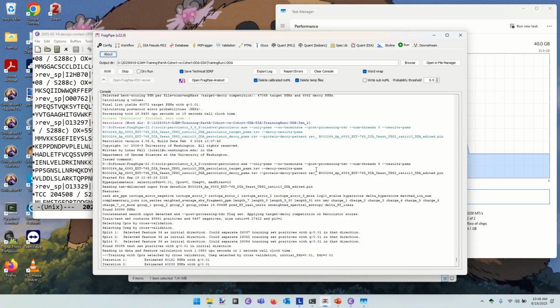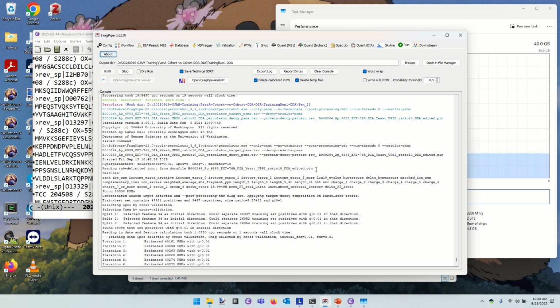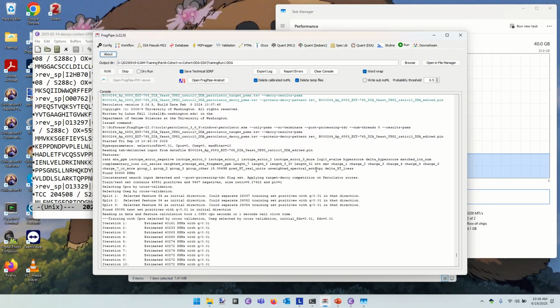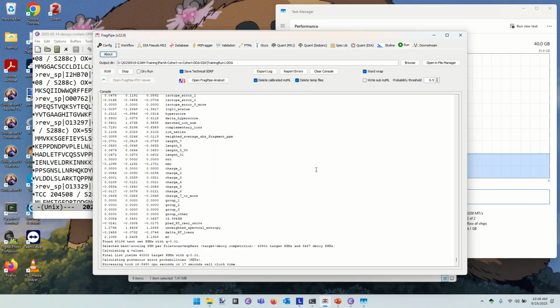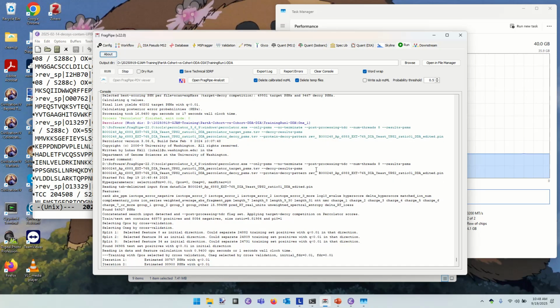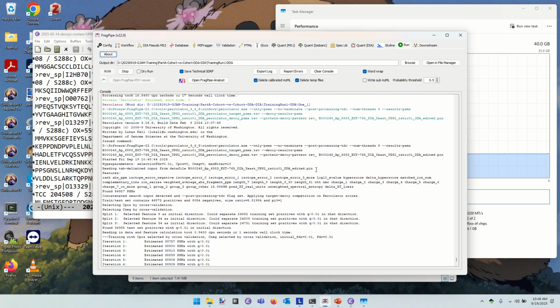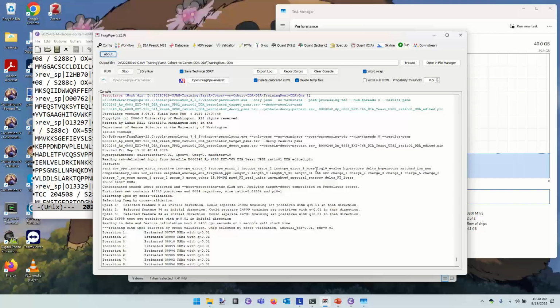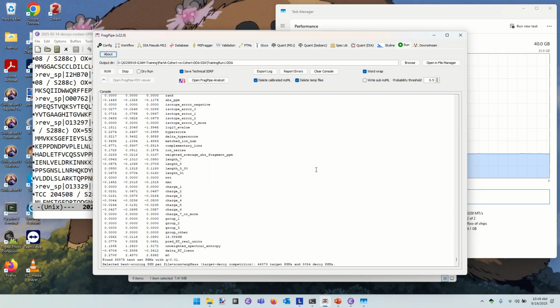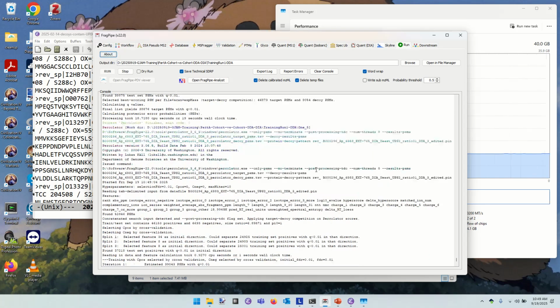But you can ask how to set up your experiments. You can ask if you want DDA or DIA. If you know the difference and you know why you want DDA, you can just ask to have a method with DDA. At the moment, I would say the number one reason I would ask for DDA is that I intend to do post-translational modification work in my data. If I'm just trying to quantify broadly, using DIA spectra is very preferable. So anytime you're relying on the quantitation, DIA is likely to come at some advantage.